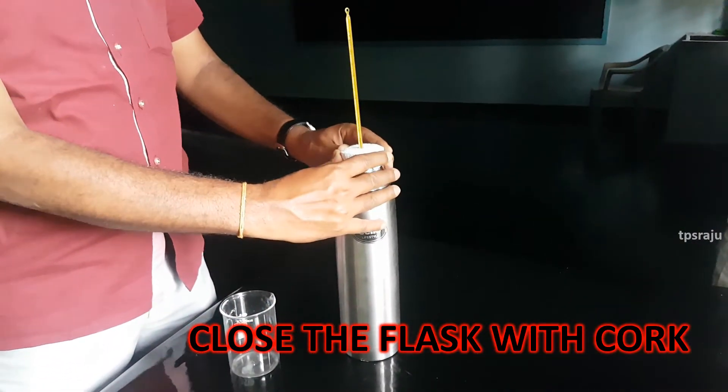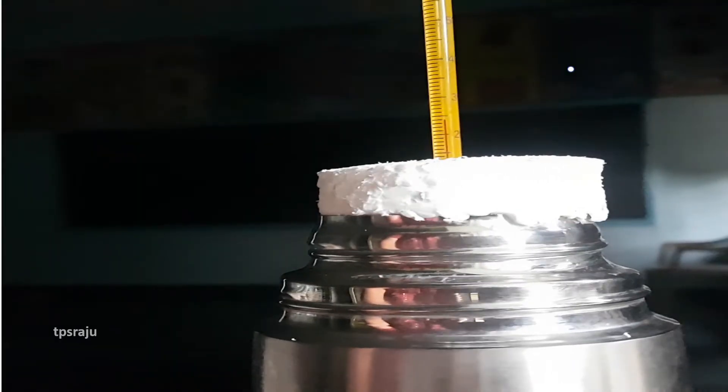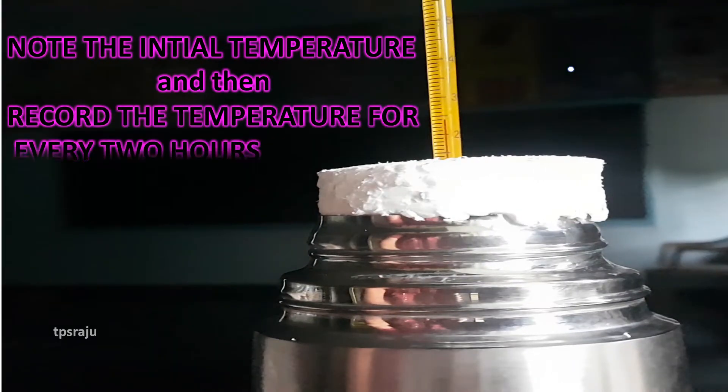Note the initial temperature and then record the temperature for every 2 hours. Look here — the initial temperature is 24 degrees centigrade.